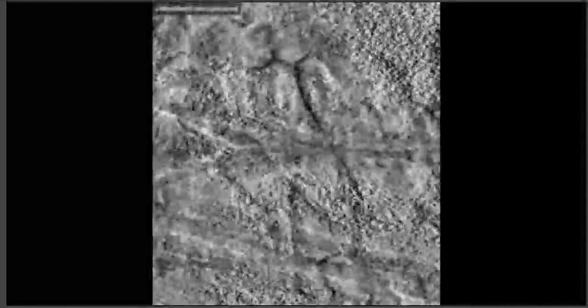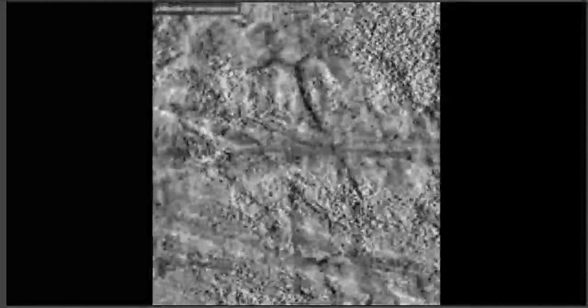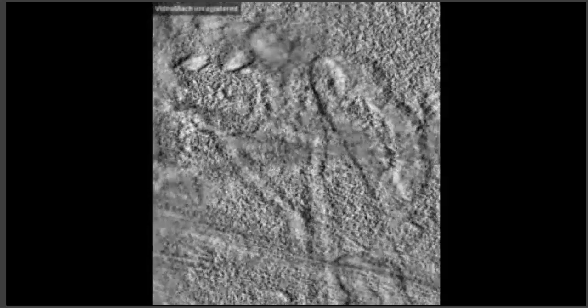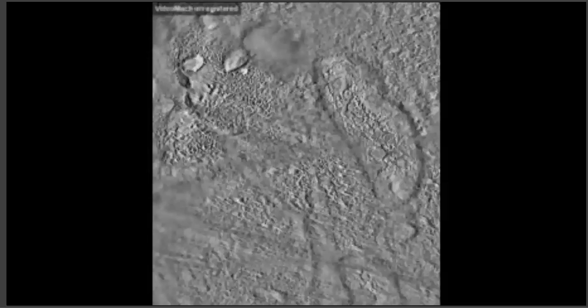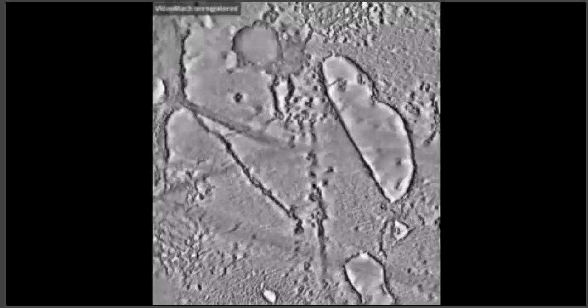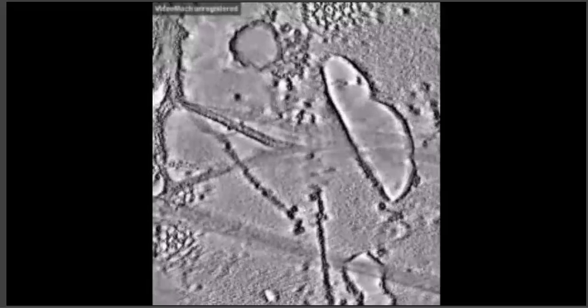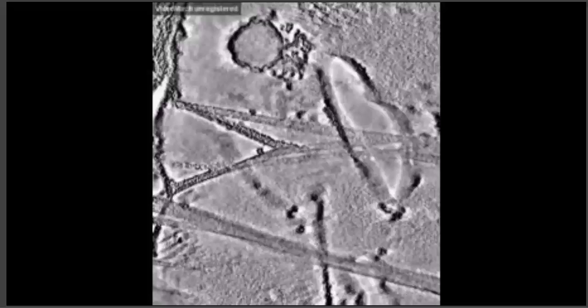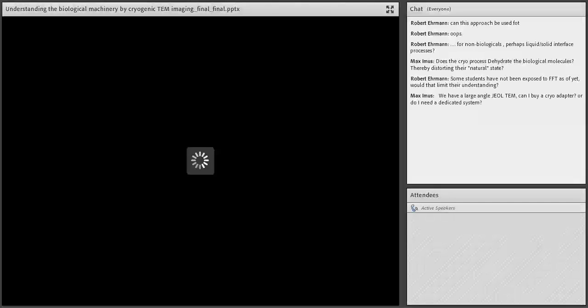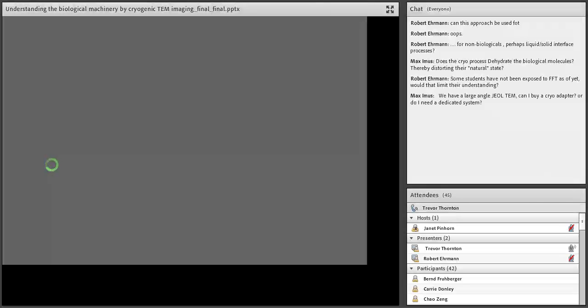And there is some deterioration of the sample with this coating? There's obviously going to be dehydration artifacts. But more importantly, we don't even worry about those because we're at so low resolution. We're literally looking just at the heavy atoms on the surface of the biological molecules, which we are assuming are probably no longer there. So let's go to the next slide. And that should be a movie as well.